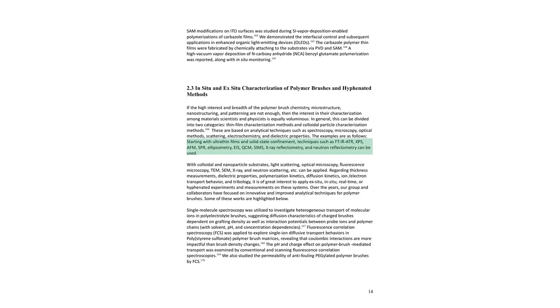This brings us to the next crucial question. Once we've synthesized these intricate nanostructures, how do we study and characterize them? The methods used depend heavily on the substrate. For polymer brushes on flat, ultra-thin films, a suite of surface-sensitive techniques is employed.